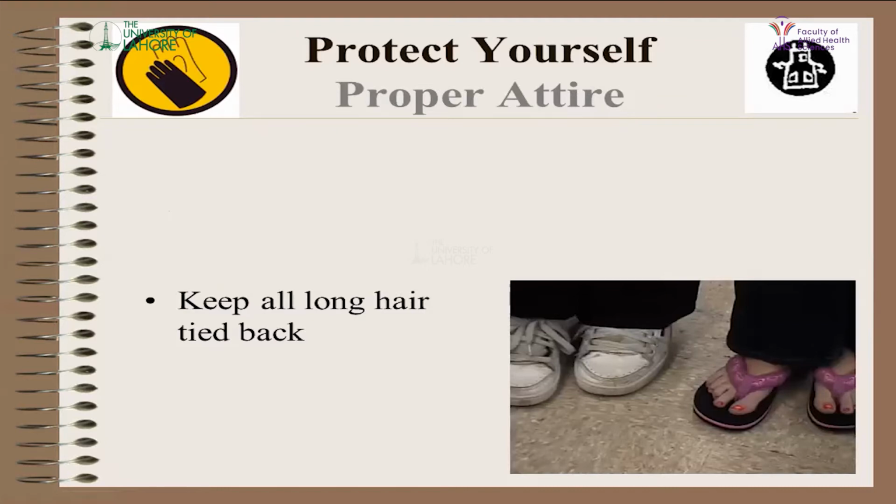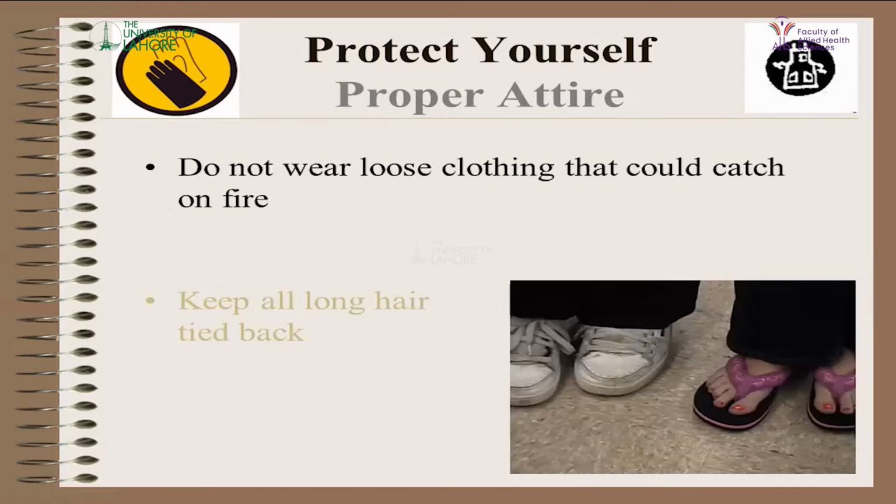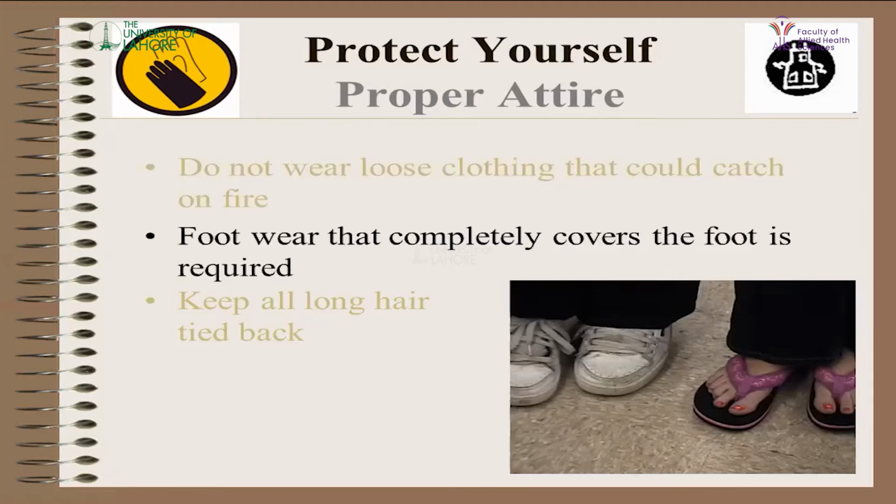And as you know, proper attire should be worn all the time in the laboratory. Always use proper PPE, or personal protective equipment. Keep your long hair tied back so that it does not interfere with your experiment. Do not wear loose clothing, so that it cannot catch fire and does not interrupt you while you are working. Also cover your feet completely. Footwear that completely covers the foot is required.